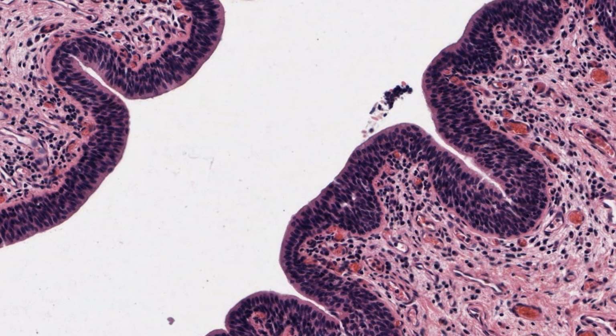And yet here in the penile urethra and later on, you'll see a prominent basement membrane supporting the epithelial lining of the trachea, both places where the epithelium is subjected to shear forces. So the concept of the basement membrane being a supporting or strengthening component may make some sense.